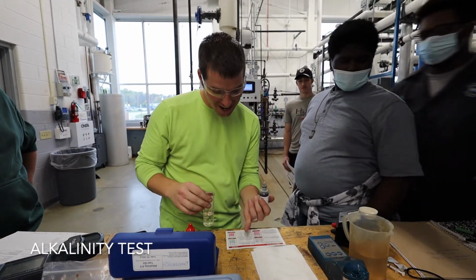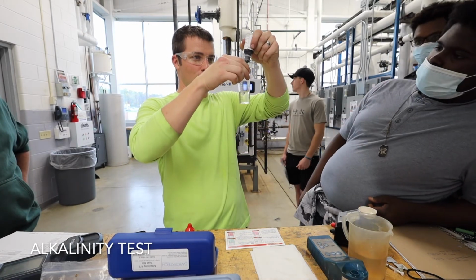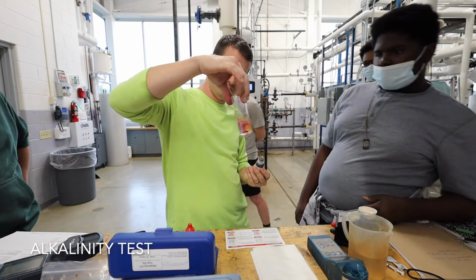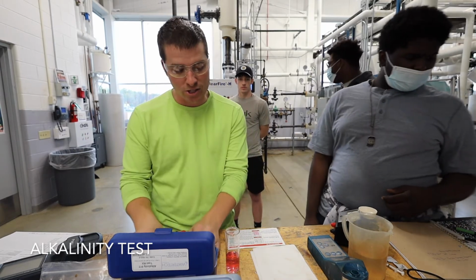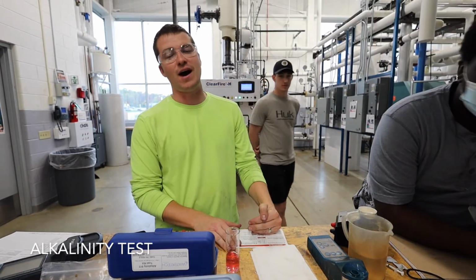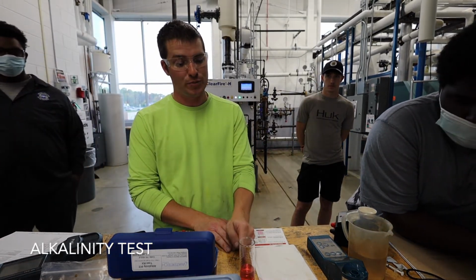Okay, so now we're gonna add 3 drops of this. It should turn green. Okay, 1, 2, 3. It didn't turn green. What's that mean? This is where it gets confusing. So it's not wrong. It's not bad. Let's assume it turned green, because I want to go through step 5, and we'll end up getting to the same endpoint. That's fine. That's the ultimate endpoint.